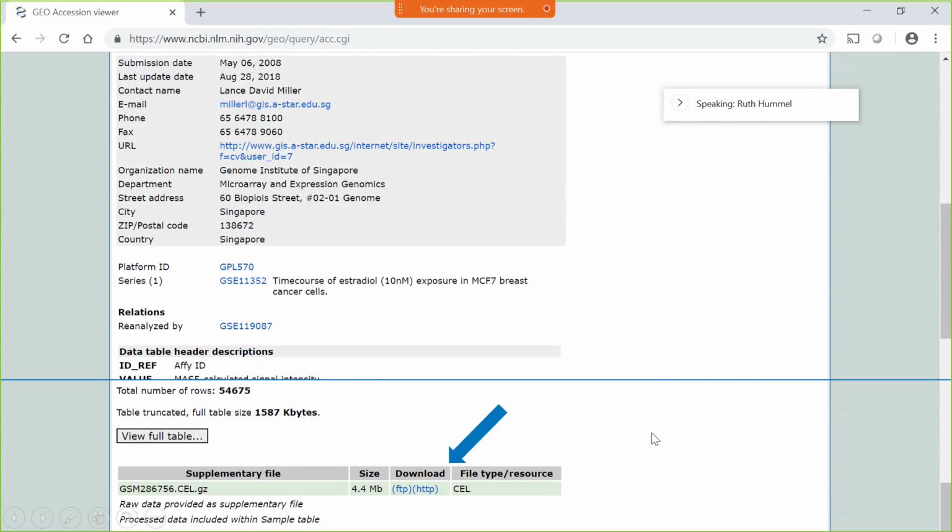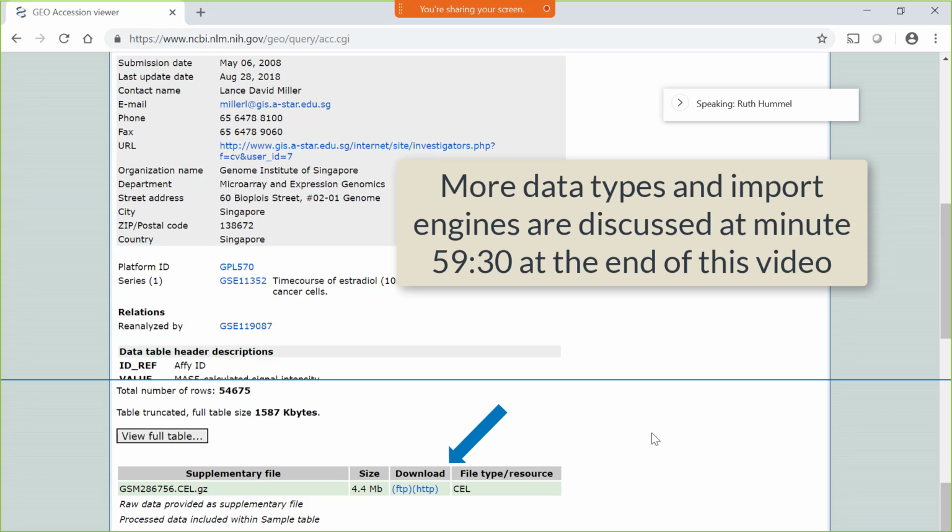Okay, when I'm on this website, the way I'm getting data, because I'm not a researcher myself, I'm a statistician who wants to analyze the data. I didn't actually collect the data myself. So I'm collecting this data by downloading it from this website. Very likely you, if you're attending this webinar, you probably are collecting your own data.